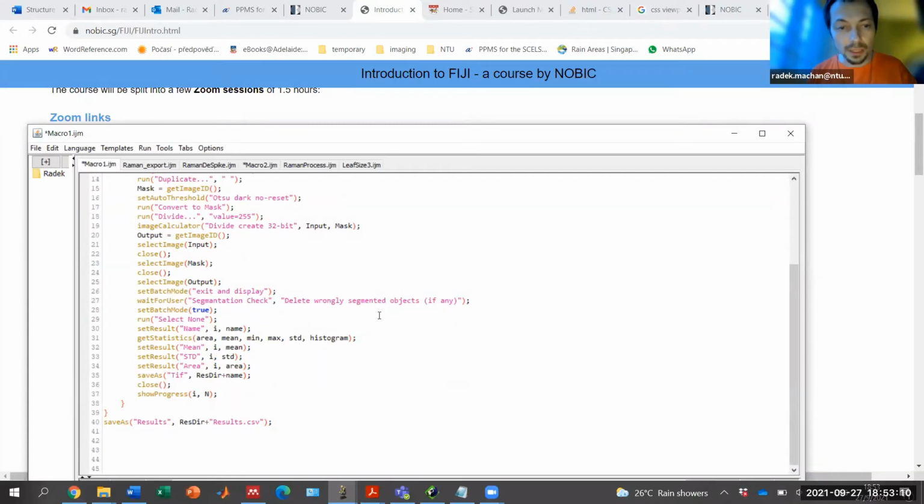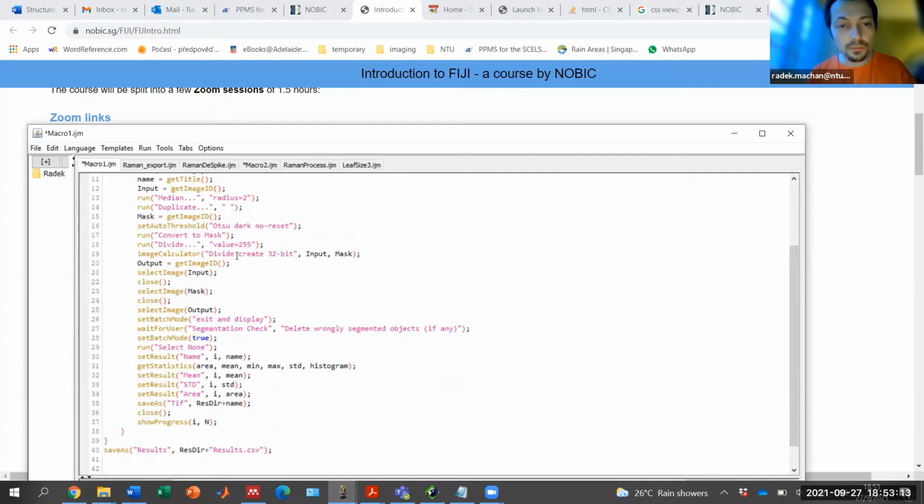Let's now solve some other thing. So we had this issue with the mask. We had that if I delete, I will have the zeros. One way how I can solve it is I need to change whatever I deleted, the selection, to infinity or to a not a number value, so that it doesn't change the average.